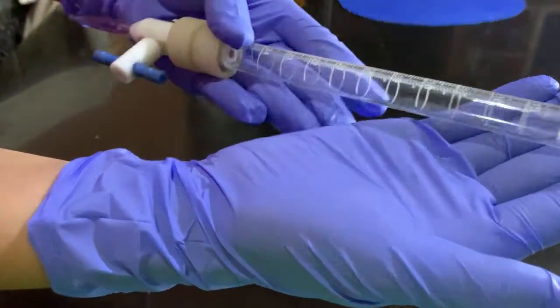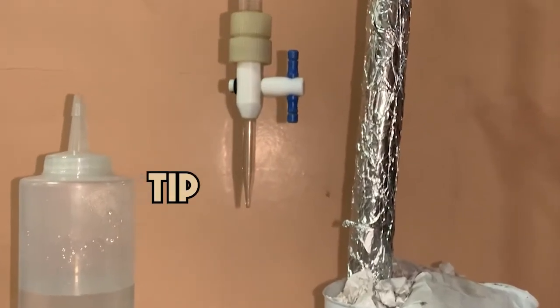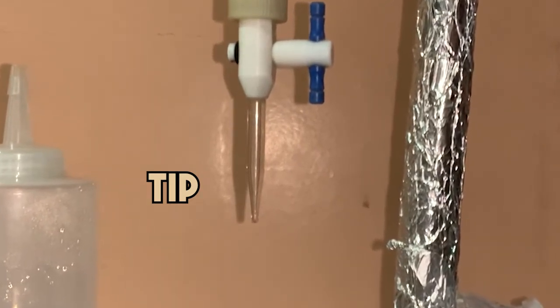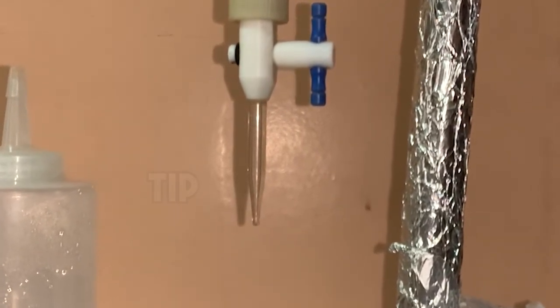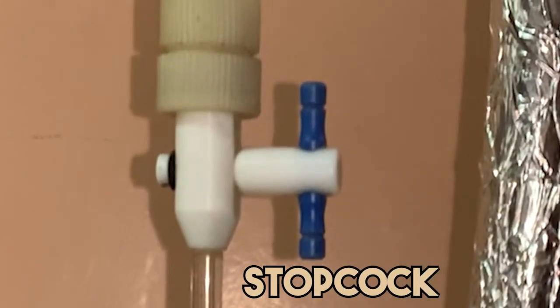Before cleaning the burette, we must know its parts. First, on the bottom is the tip, which is a narrow passage for the liquid to flow out. Then, this is the stopcock, which carefully regulates the flow of the liquid from inside to outside of the burette.